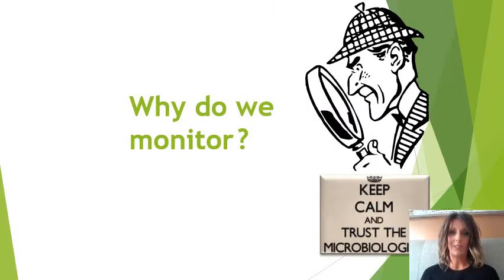So the first thing we need to consider is why. Why do we monitor? When we are making products in a clean room, we need to consider what we are trying to achieve. So eventually what we are looking for is a product that is fit for purpose and only contains the necessary constituents. Therefore, we want it free from all contamination. Contamination can be in various forms. We have solid matter contamination or particulates. This is known as non-viable contamination as it's not living.